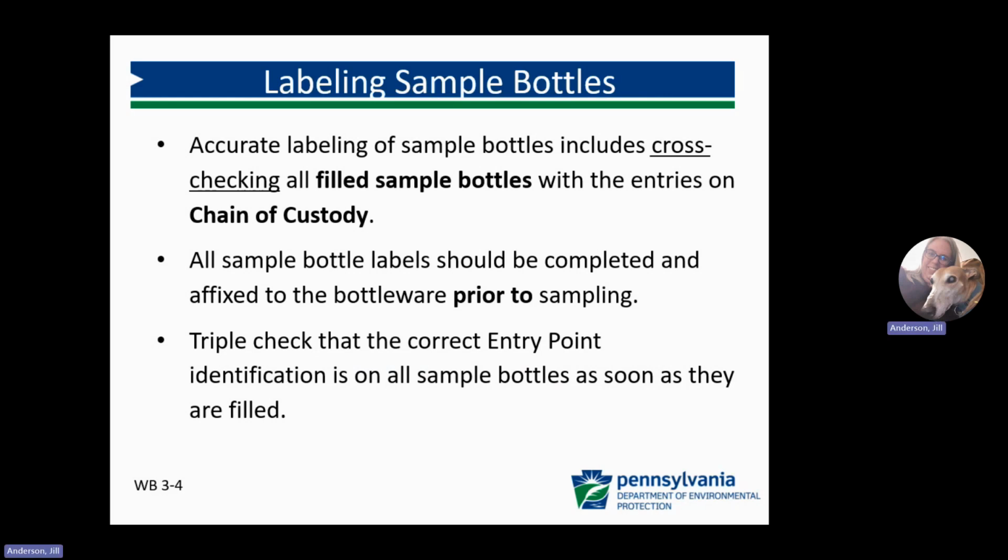All sample bottle labels should be completed and affixed to the bottles prior to sampling. There's less room for error if you already have the bottle labeled. Triple check that the correct entry point identification is on all sample bottles as soon as it's filled.